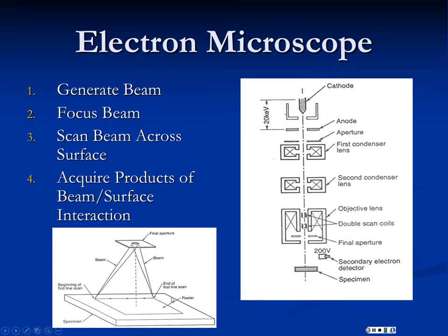The way an electron beam instrument usually works is we scan the beam over the surface in a raster pattern, and we then look at what comes out of that scanned surface. So though you see a picture, it isn't remotely similar to a light microscope, because in a light microscope, you're bouncing the light off the surface and seeing the light. Here, we usually don't look at the electrons we're shooting at the surface. Most of the time, we shoot them at the surface, knock stuff loose, and look at what's knocked loose. We scan over the area of interest and generate information over this area.